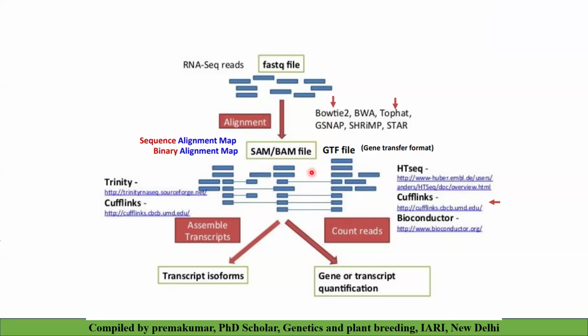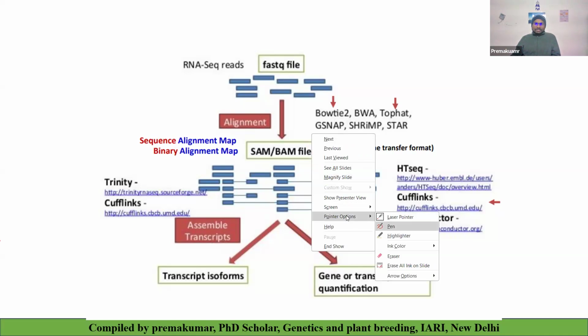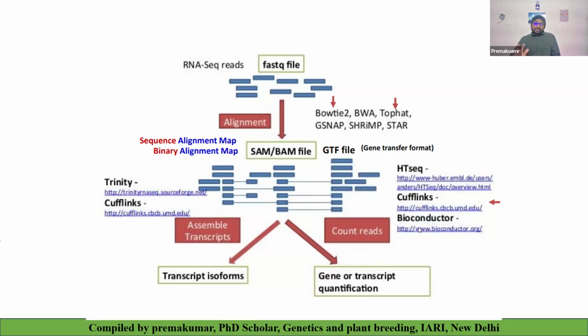Okay, sir. Earlier, the final DEG file was used to tell everything about RNA-seq, like how I did the analysis, how the Excel sheet looks, and how to do enrichment analysis. But now it is too difficult to understand, so I'm not going to confuse you. Up to this, understood?